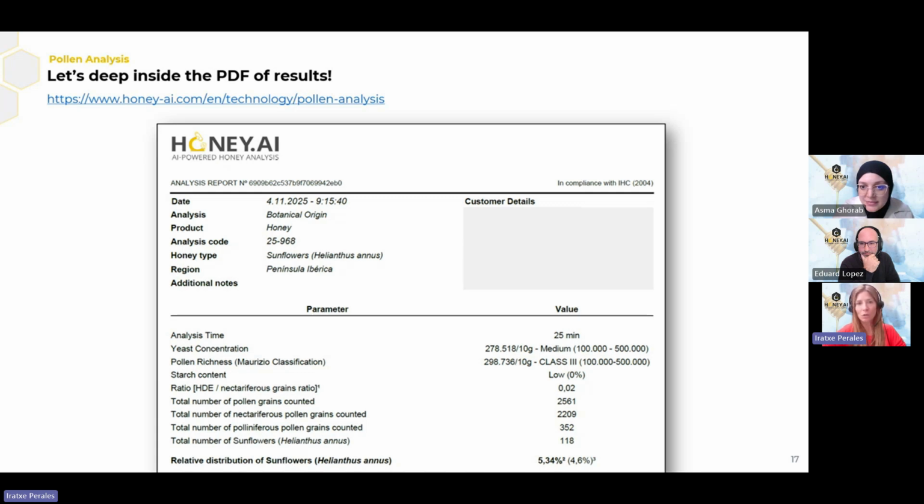Well, let's go to the PDF of results. Let's understand how we provide you with the results, which kind of information you can find after the analysis that Asma explained. Here I have included this link. This link goes directly to our website.